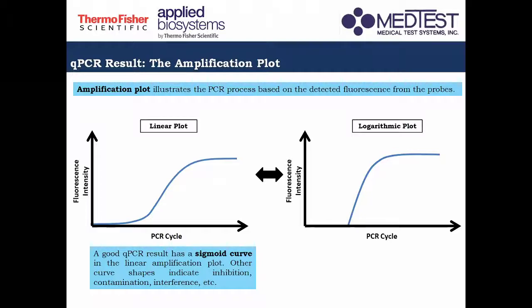This is represented by a graphical illustration called amplification plot. No? So the amplification plot will illustrate the run of your PCR based on the detected fluorescence of the probes.